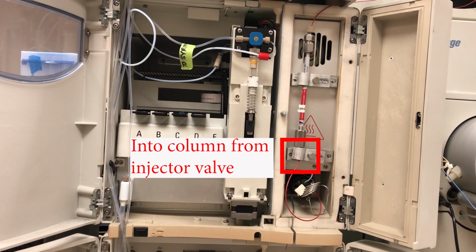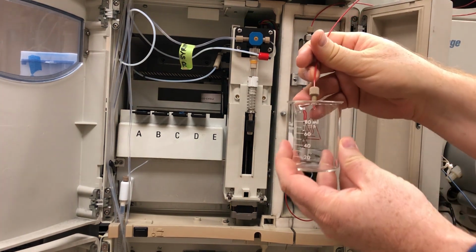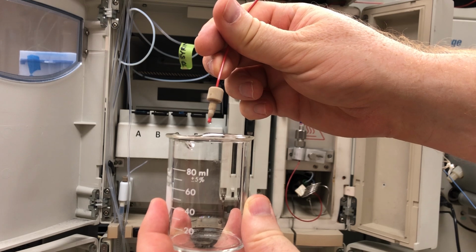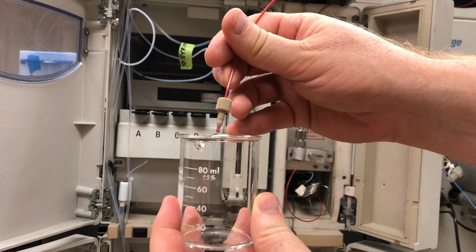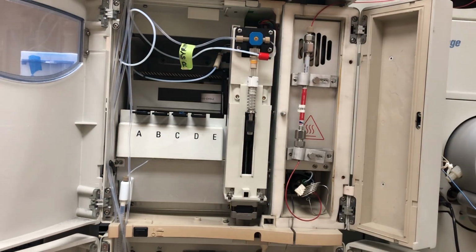Let's go back to the instrument again and just see, there's the end of the column from the injector valve, it comes out the other end, and then it really is just a tube that you can kind of connect to what you want. So if we take that tube right here, you can see that red tube is coming out of the column, and there's the drip, drip, drip of the controlled column flow rate coming out that tube right there. I don't have it connected to any detector right now, but you can essentially just plug that tube into whatever detector works, and you are in business. It's a lot easier to change a detector, to mess with a detector in LC than it is in GC, where it's integrated into a gas system.